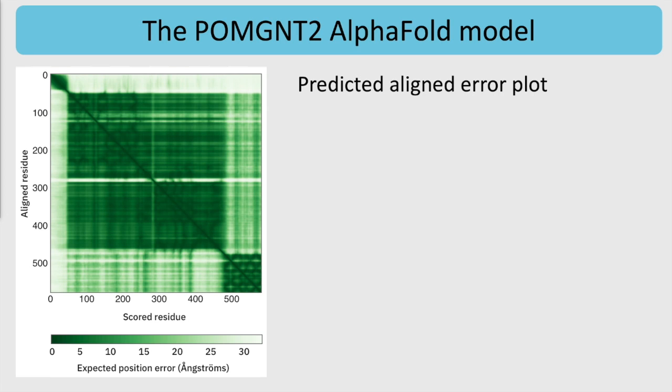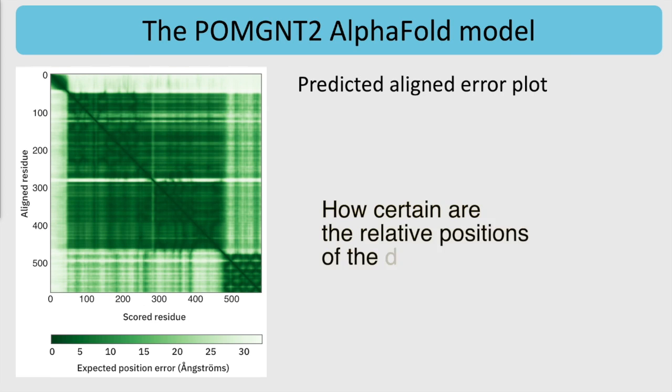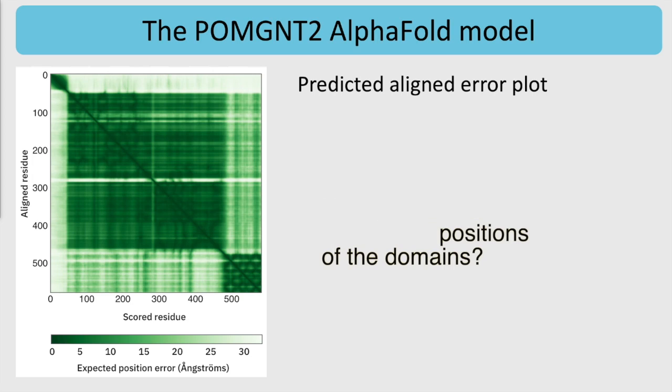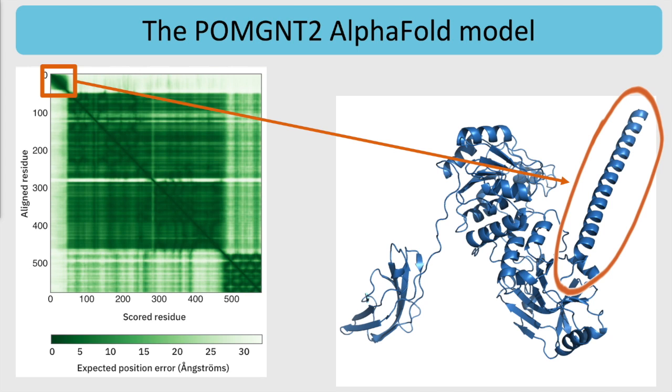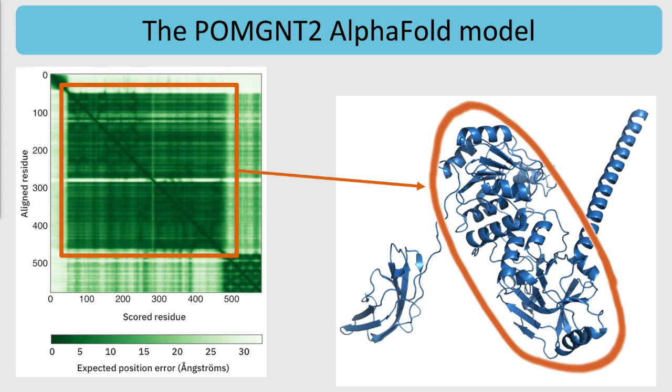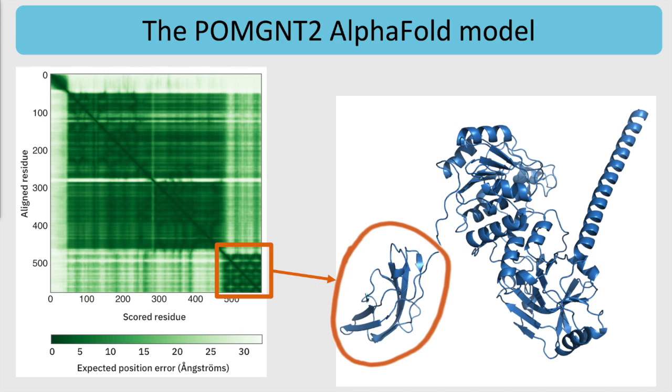The predicted aligned error plot can tell us how certain the relative positions of the domains are. We see that there are three domains, represented by the three dark green areas along the diagonal in the plot. Each corresponds to a domain that we visually identified in the structure, and AlphaFold is confident about the distances between all pairs of residues within each domain. The small square in the upper left corresponds to the long helix on the right, the large square in the center of the plot corresponds to the large domain in the middle, and the square in the lower right represents the smaller domain on the left.